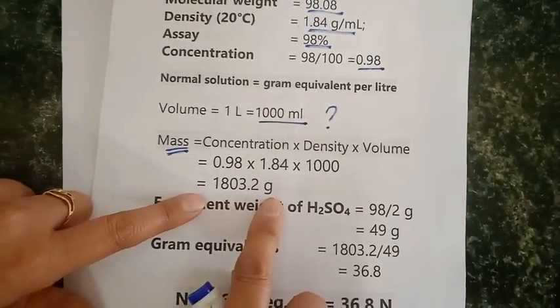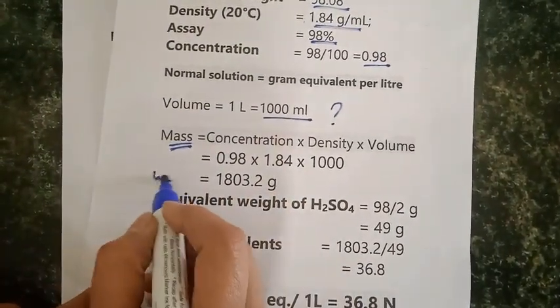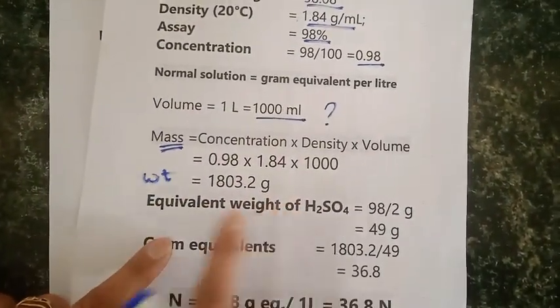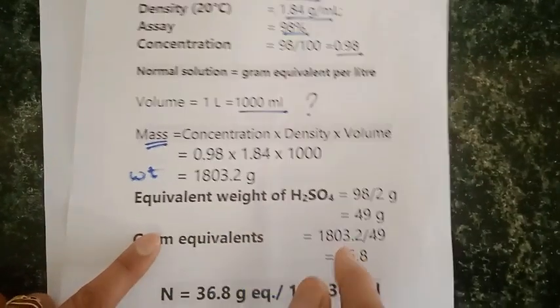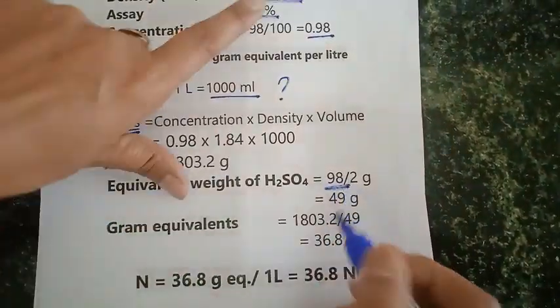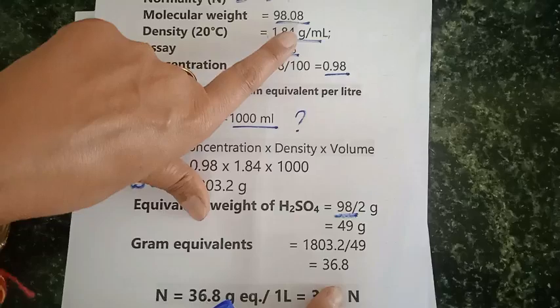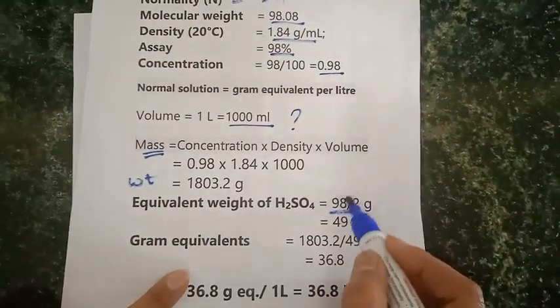I get this much of weight. Now to calculate the equivalent weight for H2SO4, it is 98 by 2 because the molecular weight is 98 divided by the n factor, which is 2.